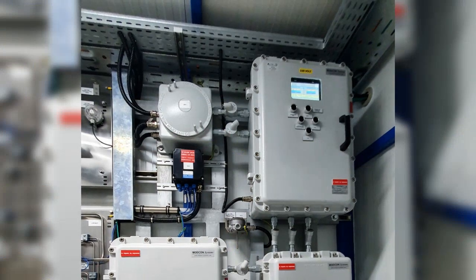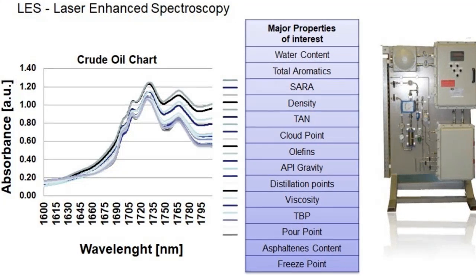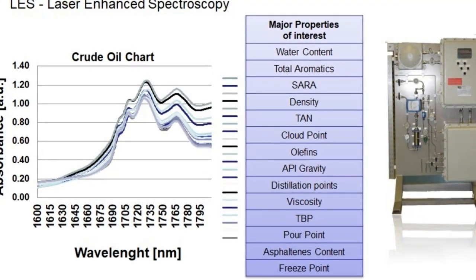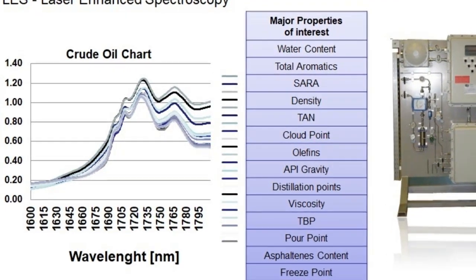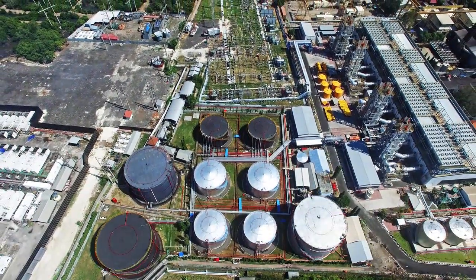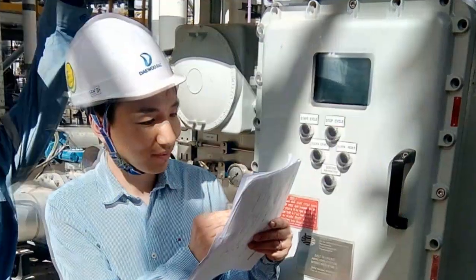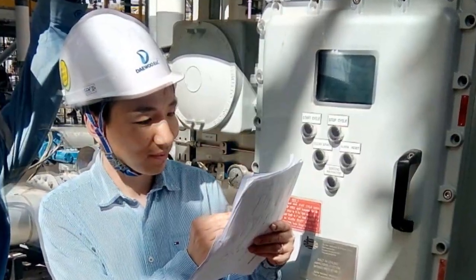With the MOD-4100 analyzer, you can measure a range of critical parameters, including distillation, RVP, salt, H2S, water, sulfur content and other parameters. Online and rapid analysis allows for the real-time detection of unacceptable levels of quality parameters, allowing you to take immediate corrective actions.